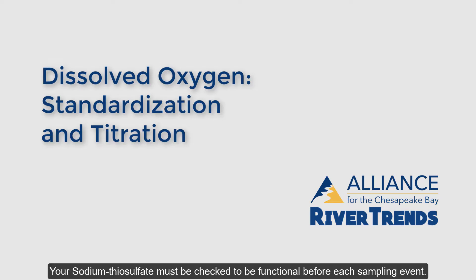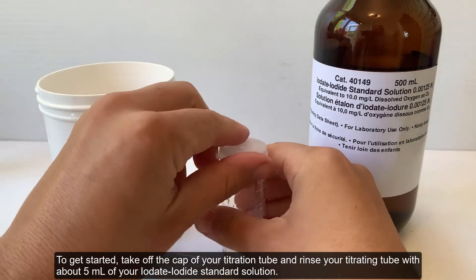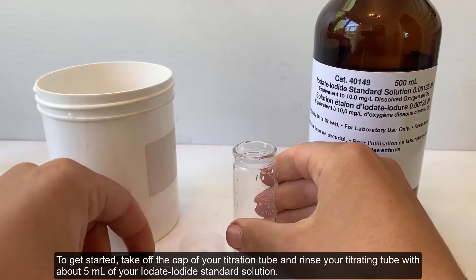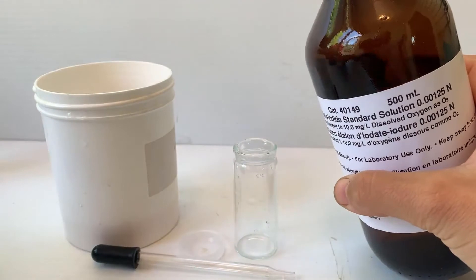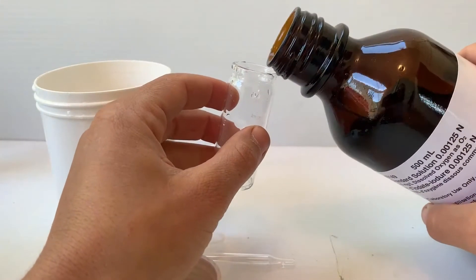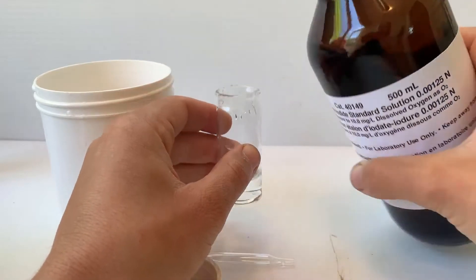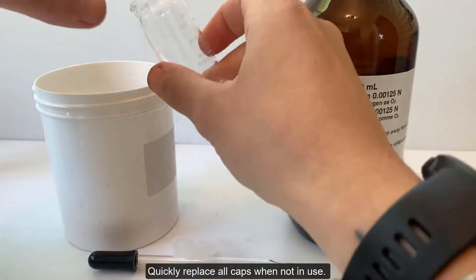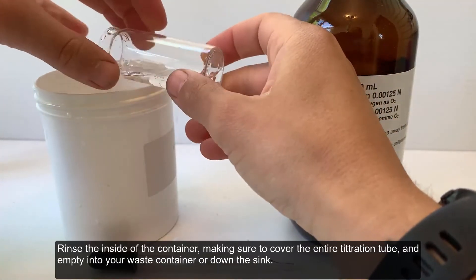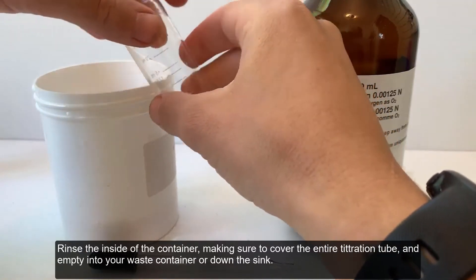Your sodium thiosulfate must be checked to be functional before each sampling event. To get started, take off the cap of your titration tube and rinse it with about 5 ml of your iodate-iodide standard solution. Quickly replace all caps when not in use. Rinse the inside of the container, making sure to cover the entire titration tube, and empty into your waste container or down the sink.